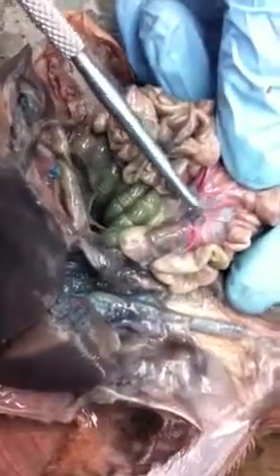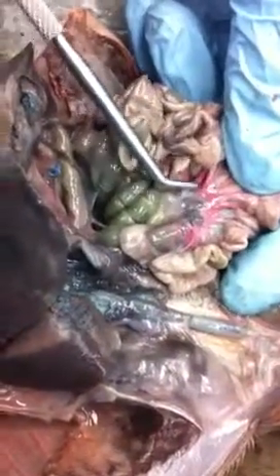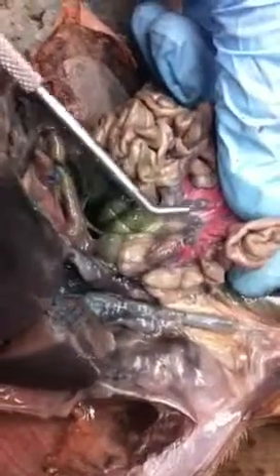Okay. And where's the hepatic portal? See in the mesentery, you can see the arteries real well. The veins in here don't get injected, so they're just going to look like they have blood in them, which is probably what this dark stuff is here, pooling. It's going to come together right into here and come down right through this membrane and right up into this membrane and go to the liver, and that's the hepatic portal.